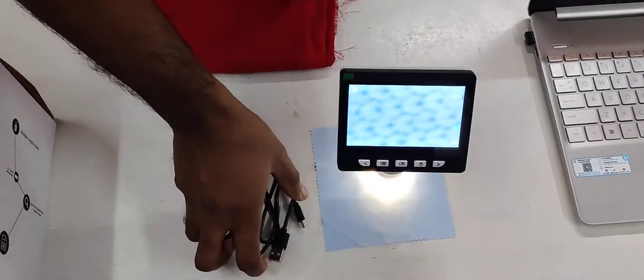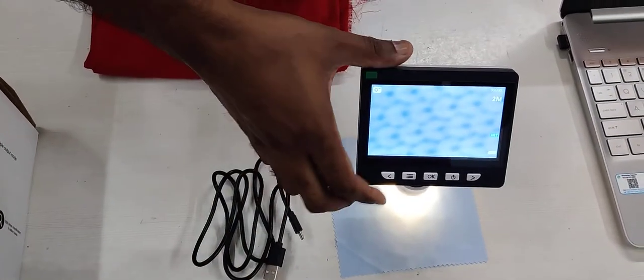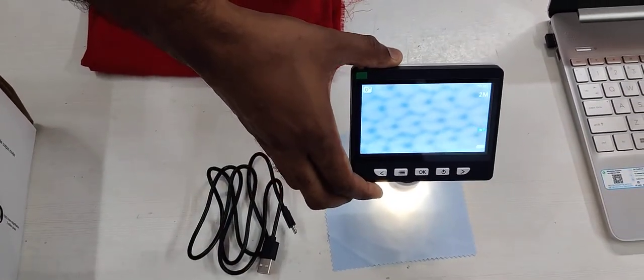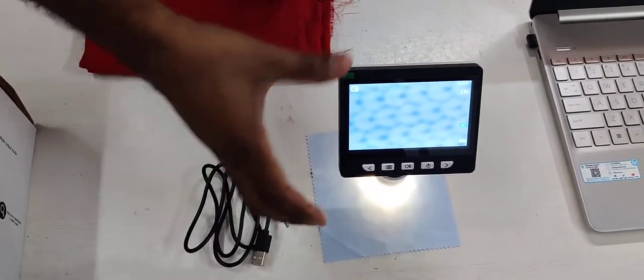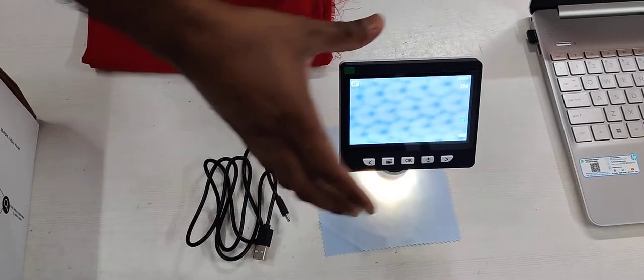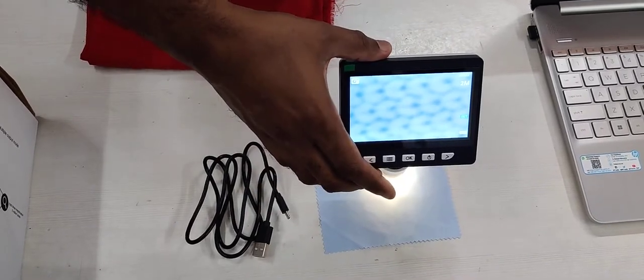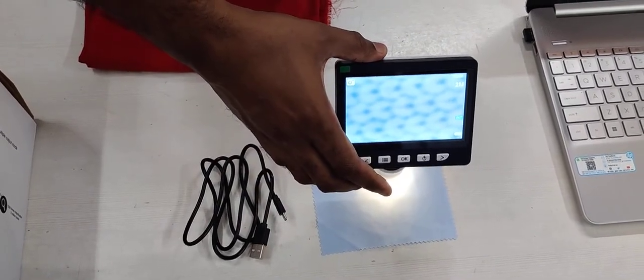Use this cable. We can see the live video on a system also to see the damages on a fabric. I will explain you.